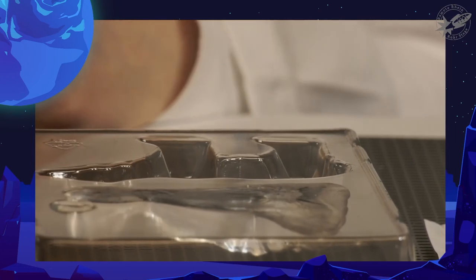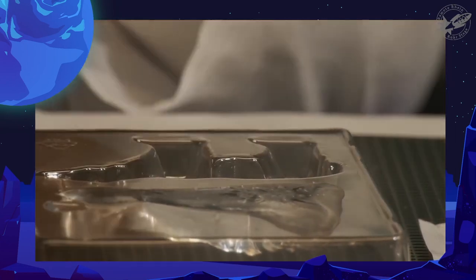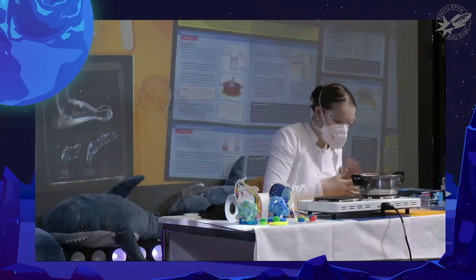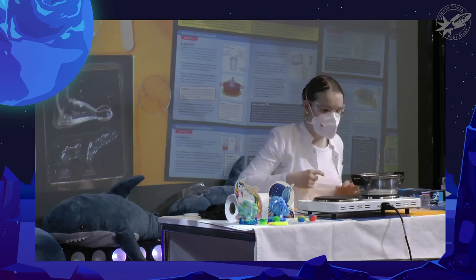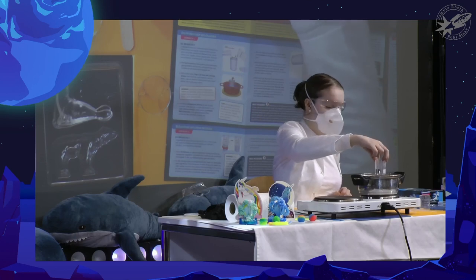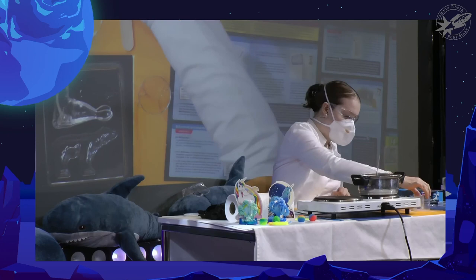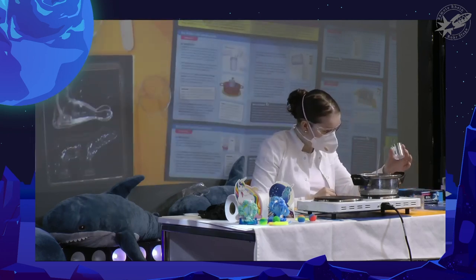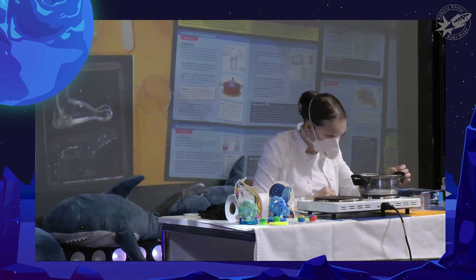Nee, es ist noch ein bisschen zu warm. Und man sieht, wenn ich einmal nicht mit Handschuhen arbeite, hat man es. It is still slightly too warm. Also wäre ich natürlich gründlich nach diesem Vortrag. You can see as soon as I don't wear gloves, it sticks to my fingers. So obviously after this talk I'm going to thoroughly wash my hands. Hier jetzt in dem Becher, wo eben ein Rest drin war, dass die Flüssigkeit nicht. I'll take this out to have it start cooling down.